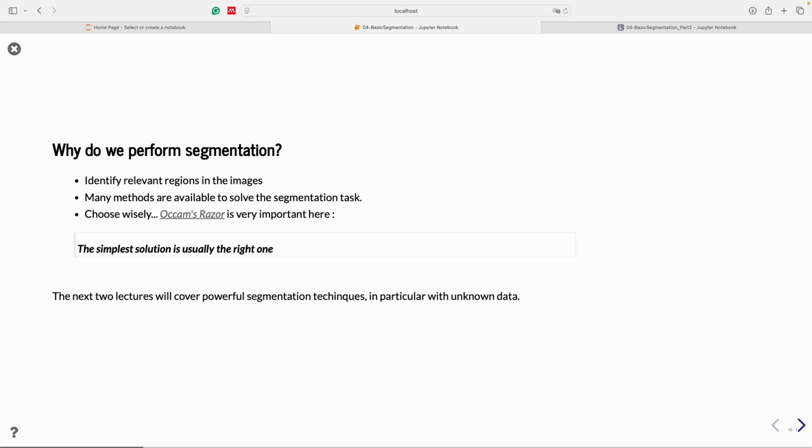You may go into machine learning, where you train a machine learning model to identify these objects. But all these more advanced approaches usually also mean that it takes time. So if you can use something simple and get the results you want, don't do the heavy stuff, because you save time in doing the simple one. And if it doesn't bring very much more to your measurement, there is no point.